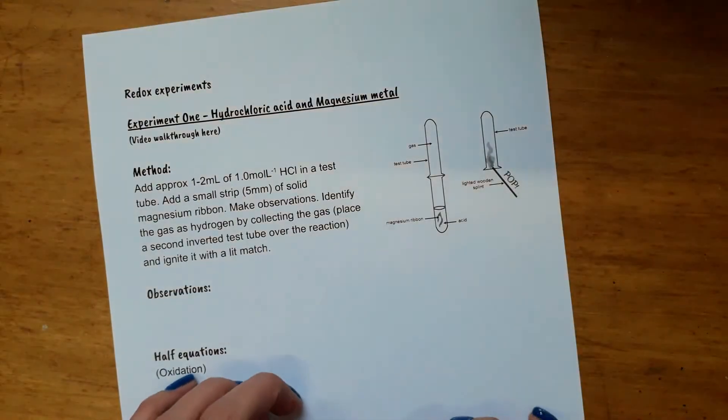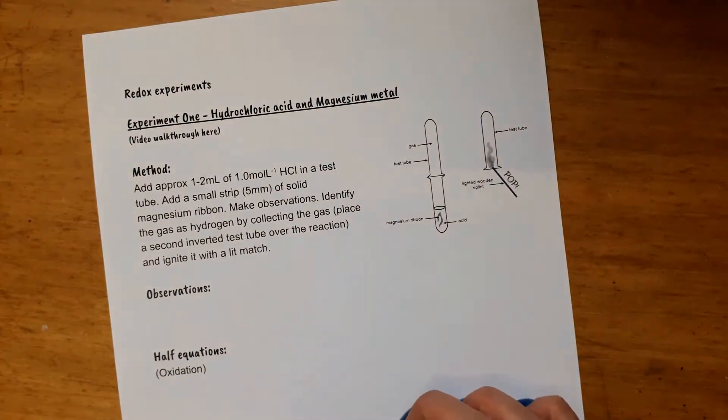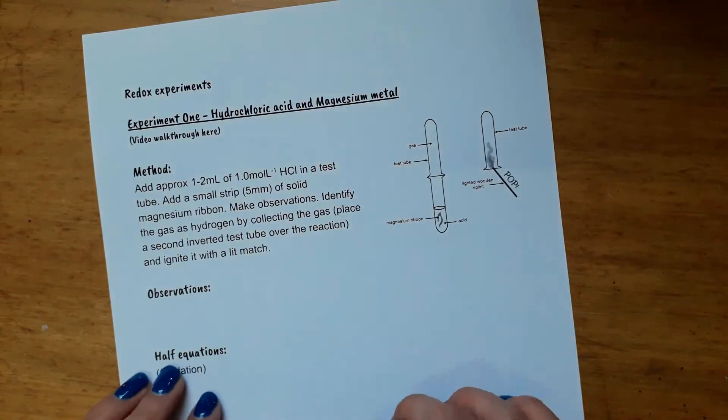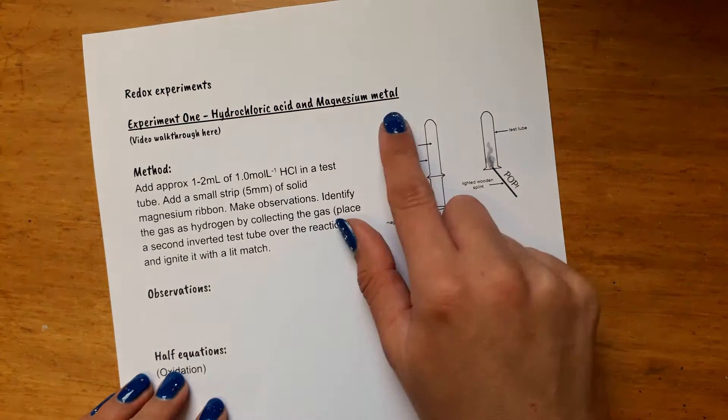Hi, so we're here just doing some redox experiments and the first one is very straightforward. It's one that you've probably seen before. It's reacting hydrochloric acid with magnesium metal.